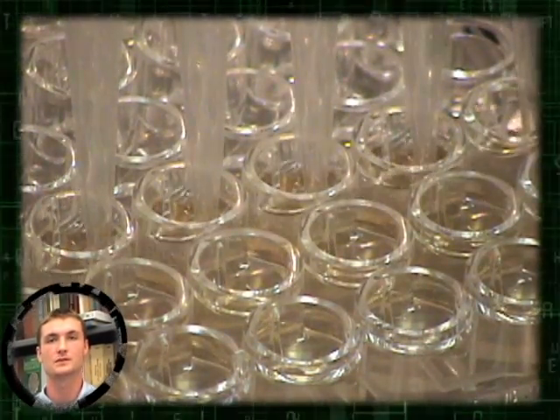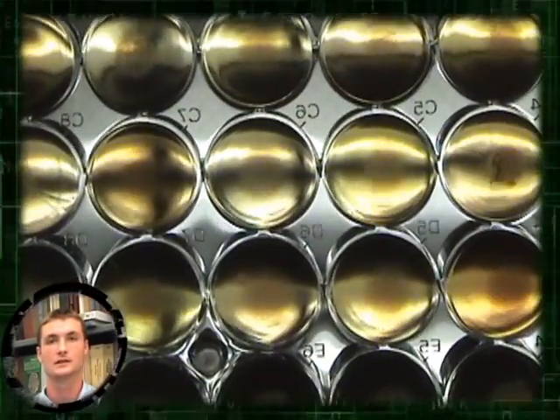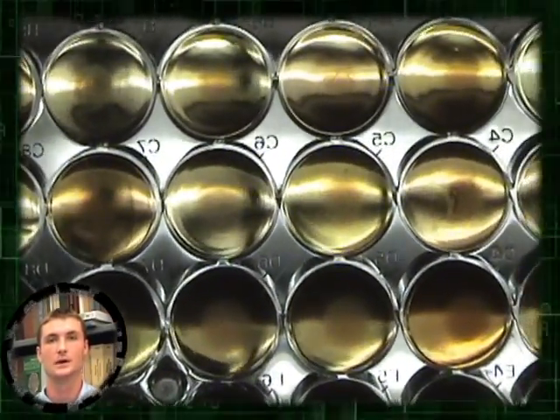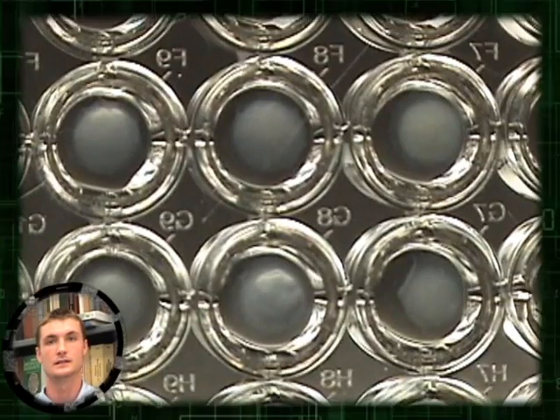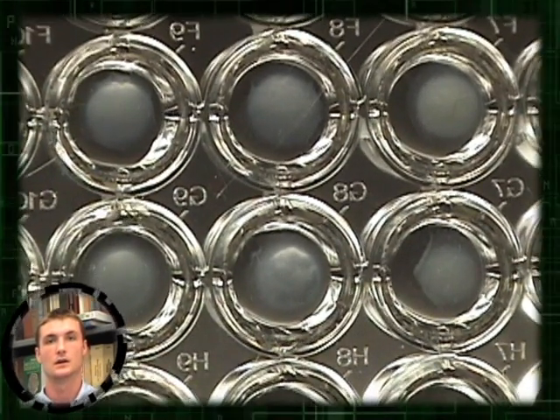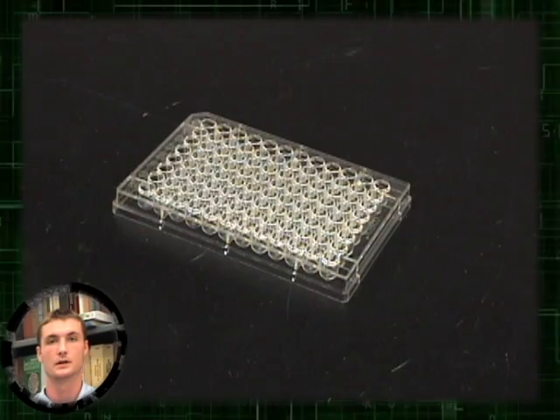Samples are then mixed with alcohol to help precipitate the DNA. Centrifuging the samples forces the DNA to the bottom of the tube or plate. The alcohol is poured off, leaving DNA and residual alcohol, which is evaporated by letting the sample dry in air for a brief period.